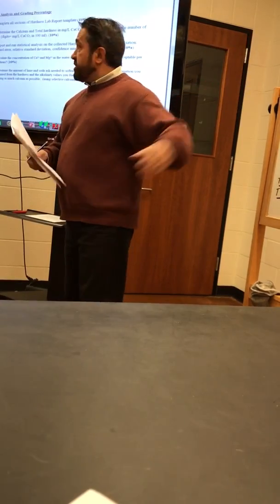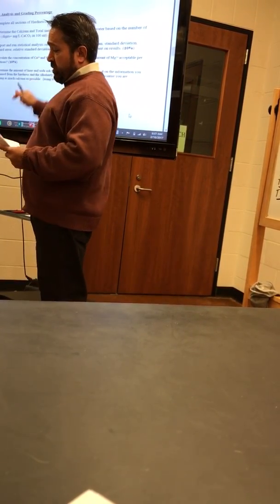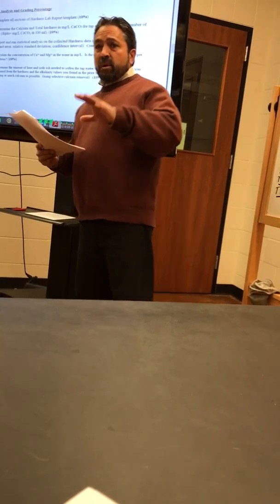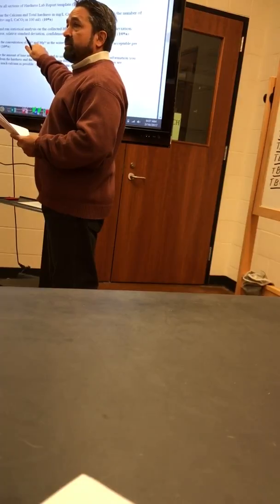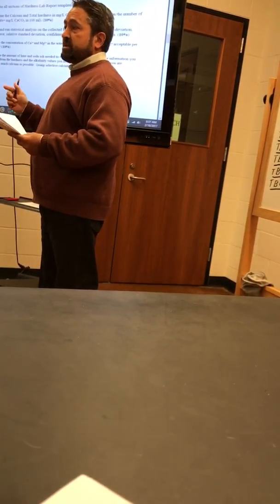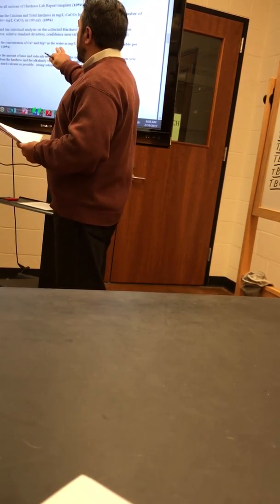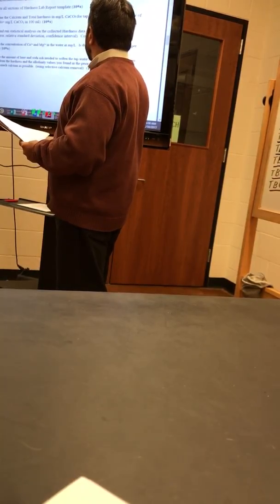Lab report again, determine the different hardness for tap water, calcium and total. Statistical analysis, same type of stuff. And then calculate the concentration. So once you know what your hardness is, you can calculate the concentrations of this in milligrams per liter of calcium carbonate, using your equivalent weights. Okay? So once you get there, we can talk to that a little bit if you don't remember how to do that.